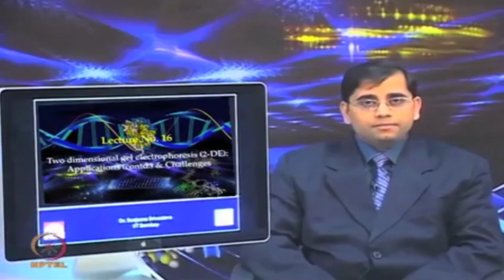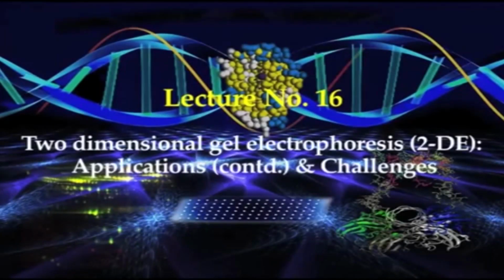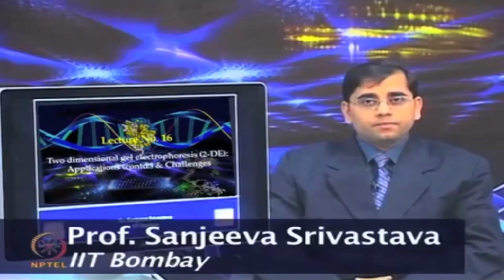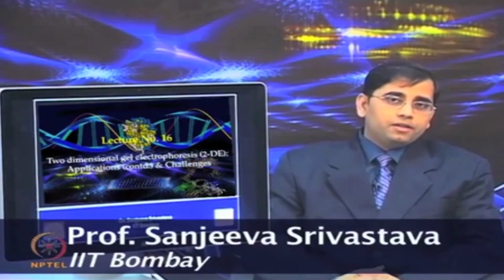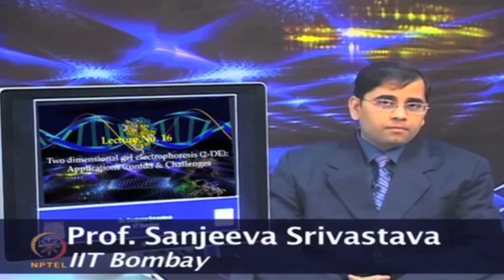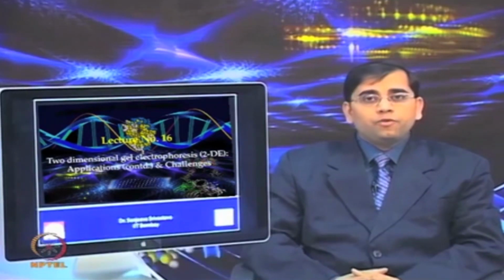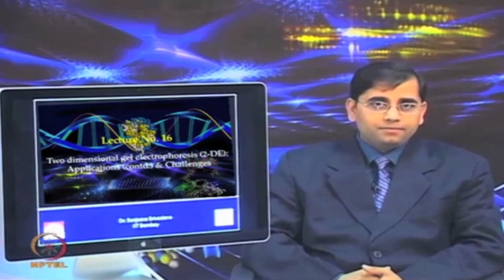In today's lecture, we will talk about applications of two-dimensional electrophoresis. If you recall, in the previous lecture, we started discussing some case studies about two-dimensional electrophoresis applications. So, as you have studied in this module, what are the different types of workflow involved in performing two-dimensional electrophoresis experiments?